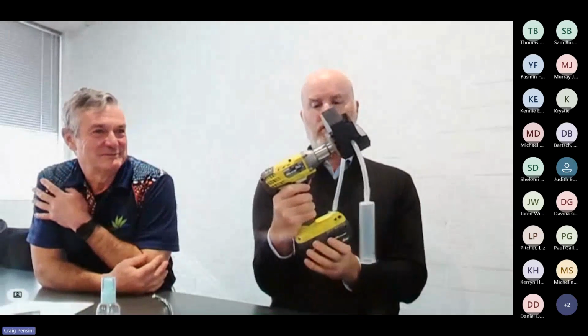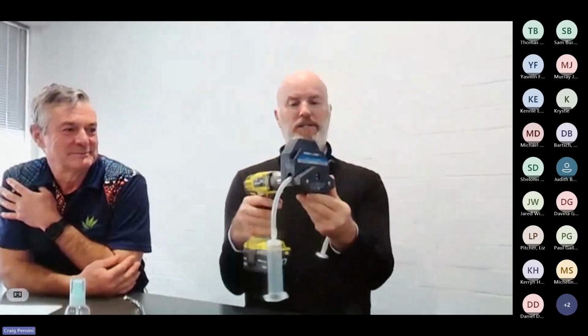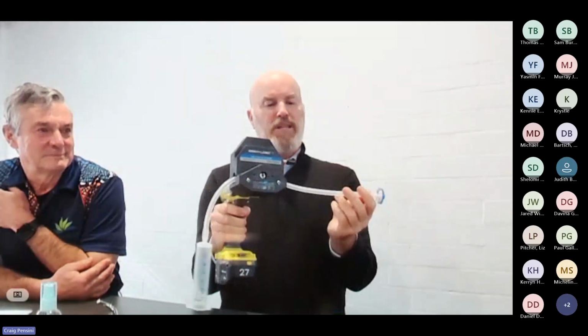Did you want to also bring out your green machine? True tradie theme. The other way is to separate your plunger, and then you've got your filter and your syringe. Oh, and here's one I prepared earlier. So we've got these drill systems. It's a regular old drill attached to a peristaltic head. You put your coarse filter, the syringe body, on one end, and then this end is your filter. These only go on one way, so it's nice and easy to tell. Then you drop that into the water, and you can filter it, and it squirts it through.